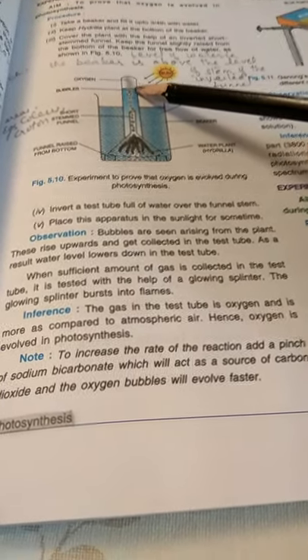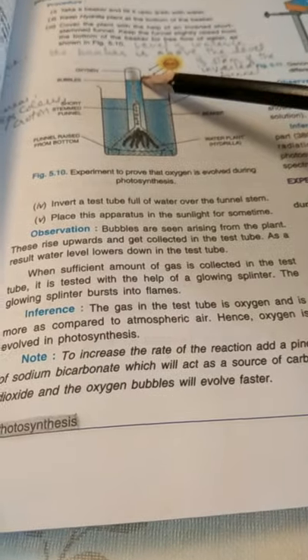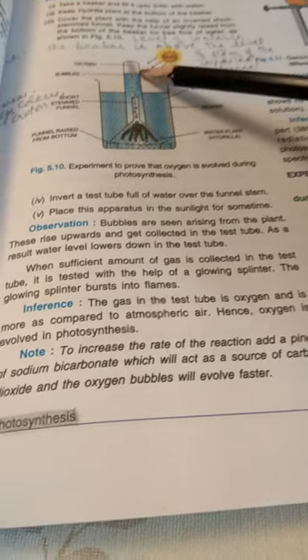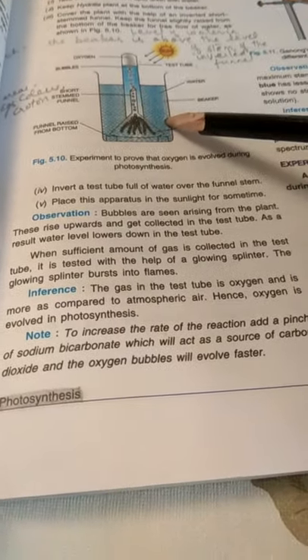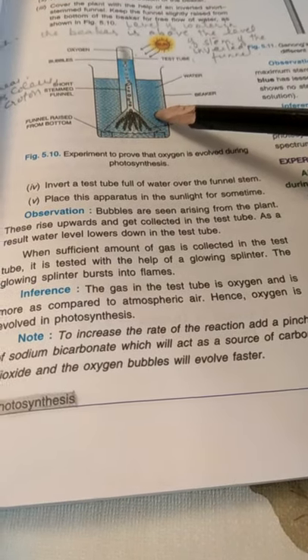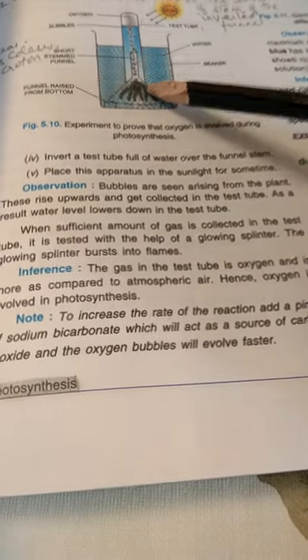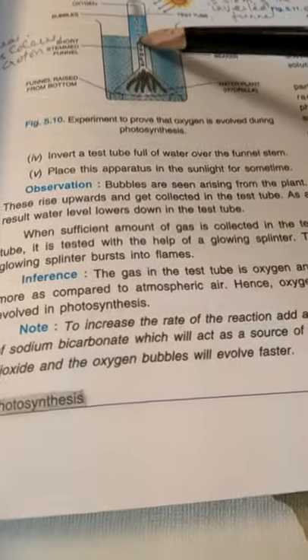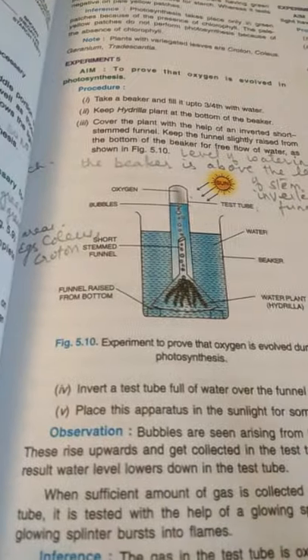We tilt the test tube and put a glowing splinter into it. The glowing splinter bursts into flame, proving that the gas supports combustion — that gas is oxygen. So oxygen is more concentrated here compared to atmospheric air, proving that oxygen is evolved in photosynthesis. To increase the rate of photosynthesis, we can add a pinch of sodium bicarbonate to the water in the beaker, as it acts as a source of carbon dioxide, releasing more oxygen faster.